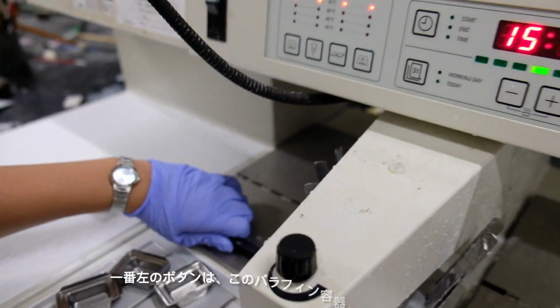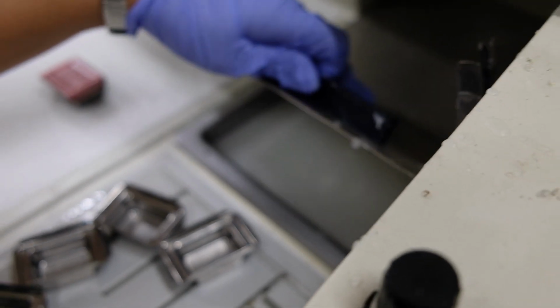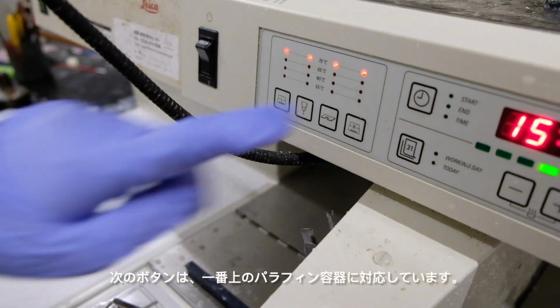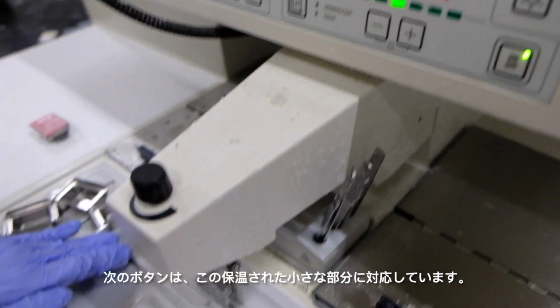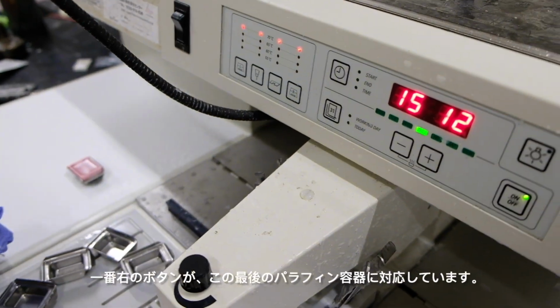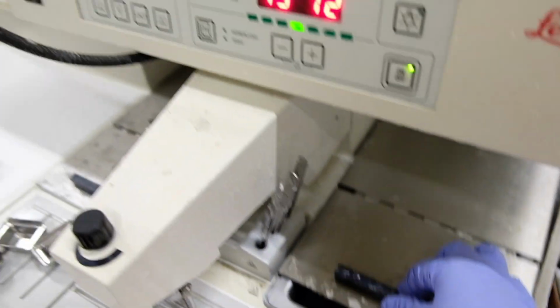The left one corresponds to this paraffin container, which is currently solidified. The next button corresponds to the top part, which has the paraffin in it. The next button corresponds to this small area here, which is kept warm, and that last button shows the other paraffin container.